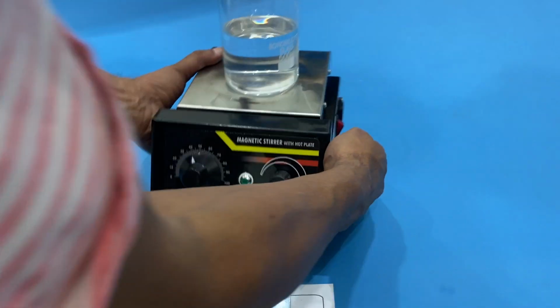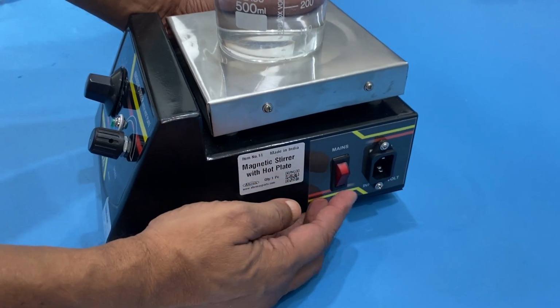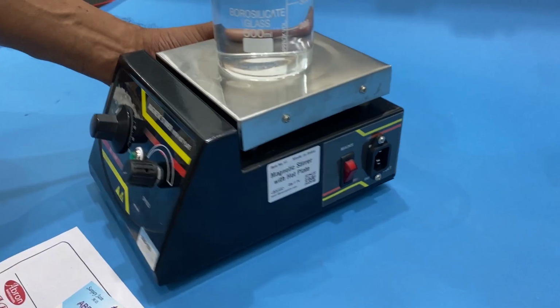It has a power cable, an international computer type, and this on off switch is there with the light indicator.